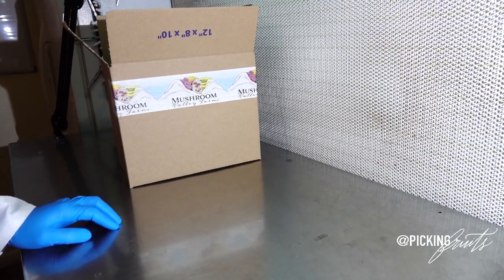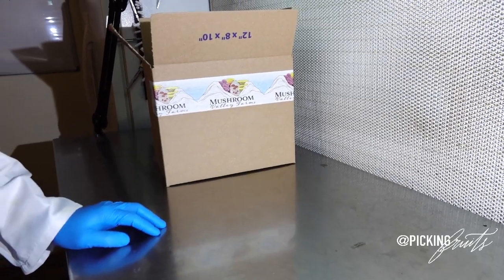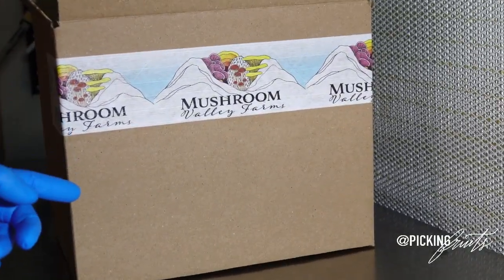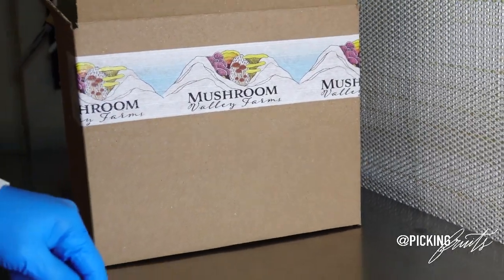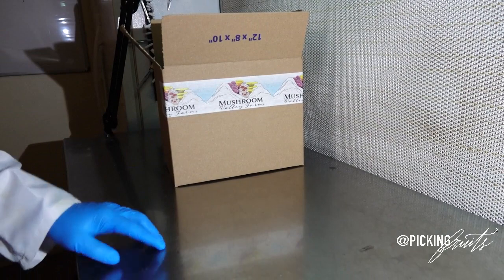Hello friends, welcome to the Picking Fruits channel. Today we are in the lab and we're going to be showcasing the Mushroom Valley Farms Complete Liquid Culture Kit. I will be showing you what comes in the box and I will also be making a tutorial showing you how to use the contents in the box. So stay tuned for that.